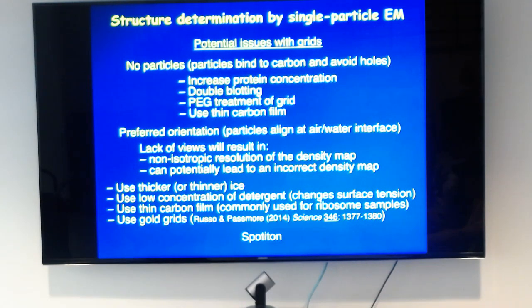People who have preferred orientation, that might be the first thing they try to do if they have cryo time. I have found that I'm working with at least one or two users per month who want to do a tilted data collection. Usually what ends up happening though is they want to go back to the bench and just fix it biochemically in some way. Why? Why do they want to fix it?